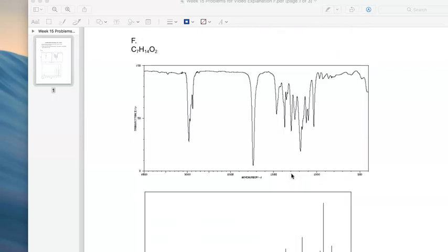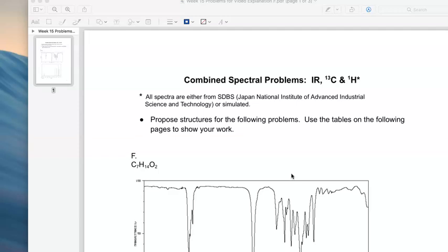Our first step to completing this problem is to determine the ratio of our carbons bound to our hydrogens. This will help us to determine if there are going to be any rings or pi bonds. These outcomes will be indicated by any hydrogens missing from the formula. We would also consider any halogens or nitrogens present in the formula, but since our formula does not have any, we do not need to worry about them.